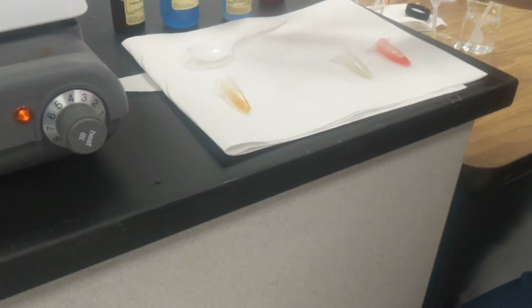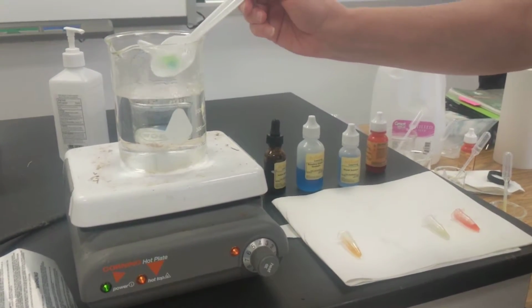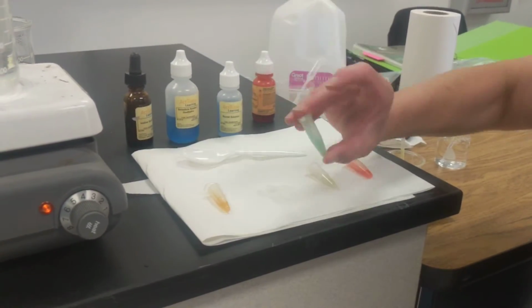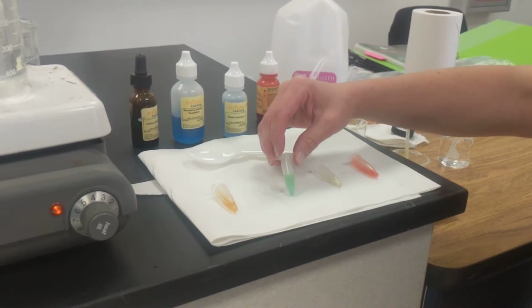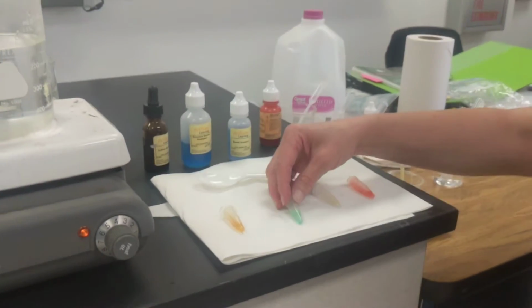There's no starch. And let's pull our item out here. And this is kind of turned green. So since it's green, it's kind of on its way to turning yellow and possibly orange or red. I would say that there's a little bit of sugar in our butter.